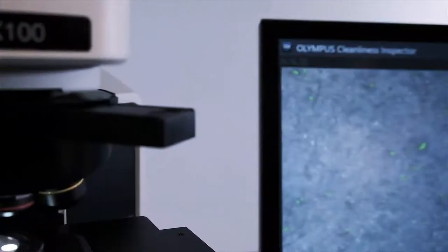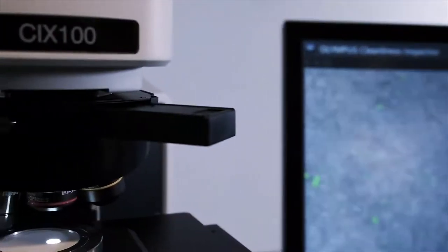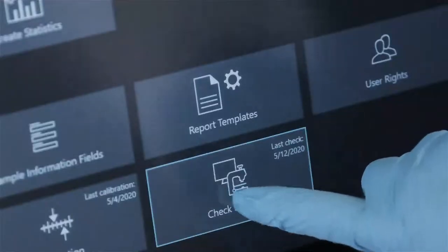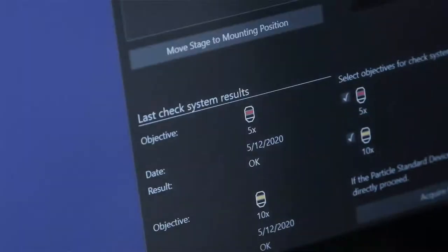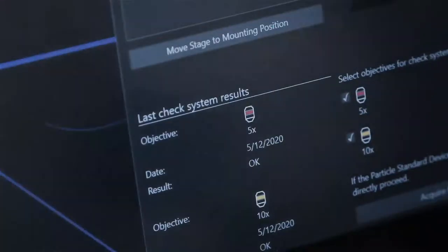The protected optical alignment without any moving parts combined with regular system self-checks help ensure reliability and repeatability of measurements.